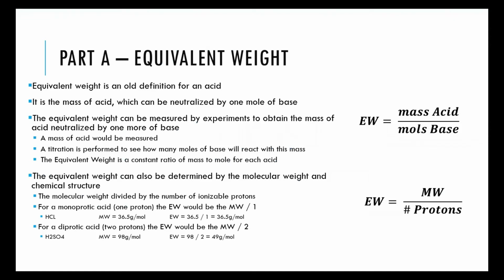In the first part, you're going to be looking at titrating potassium hydrogen phthalate, abbreviated KHP, with sodium hydroxide in order to determine the equivalent weight of an unknown. Now, all of the unknowns in lab are this potassium hydrogen phthalate, but in differing amounts. There's a filler in there as well. And you're going to perform the titration to determine its equivalent weight.